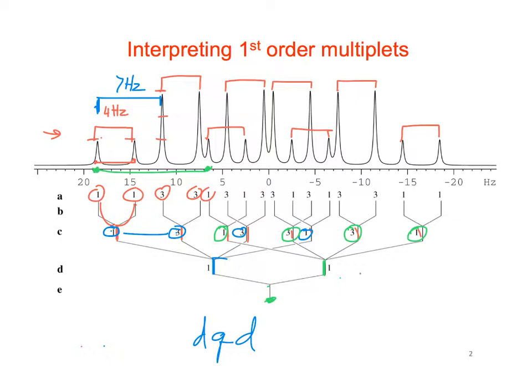Okay, so sometimes J values do not exactly match.